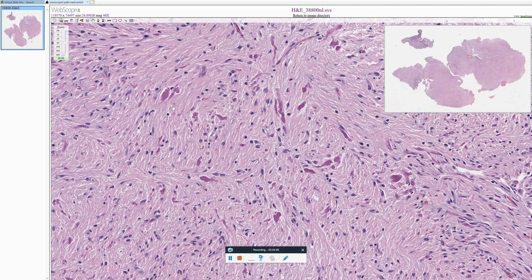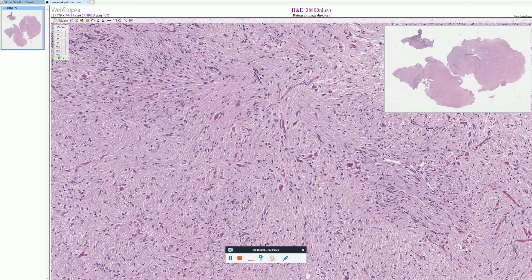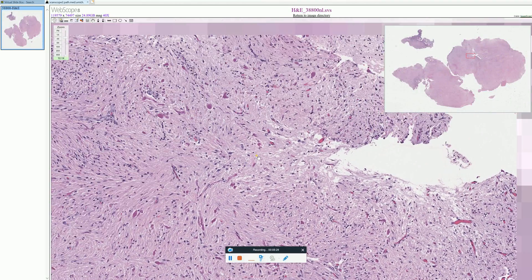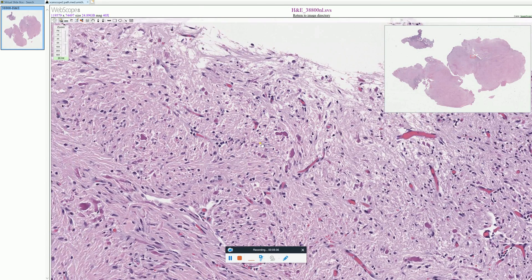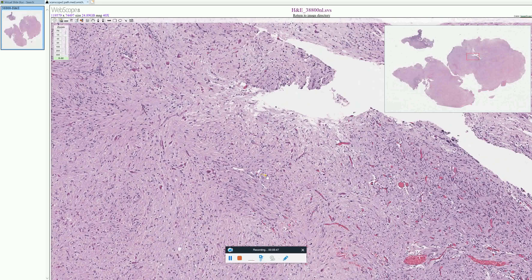This is important to recognize because pilocytic astrocytomas and craniopharyngiomas with this Rosenthal fiber reactive process in the surrounding non-neoplastic brain can both occur in the same areas, particularly in the suprasellar region. So this is something to consider whenever you're looking at biopsies from the suprasellar region. Rosenthal fibers can also be seen in certain genetic disorders, particularly Alexander's disease, in which they would be much more profound and numerous. These are Rosenthal fibers — a very characteristic finding in pilocytic astrocytomas, although not specific for them.